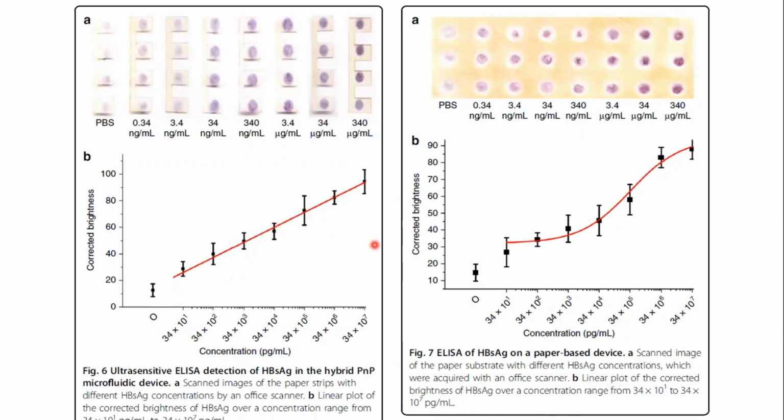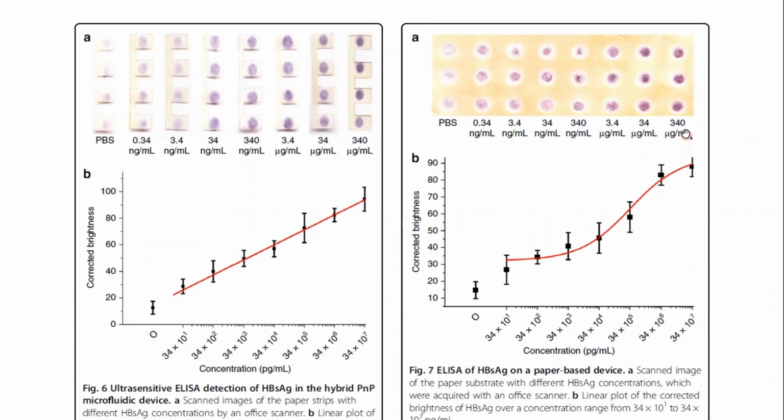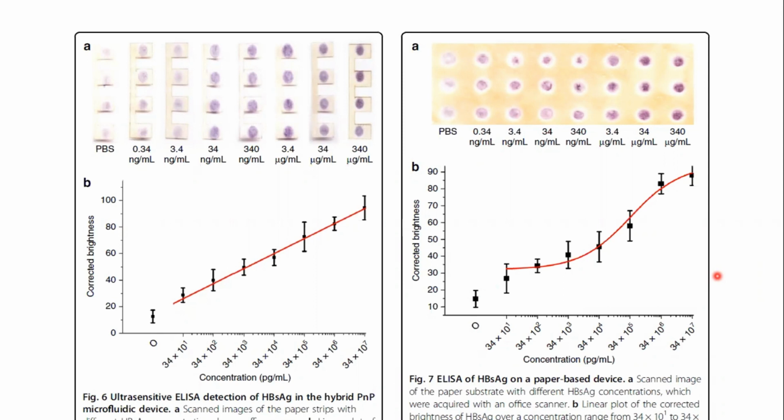of what I talked about before, the back and forth flow through the paper substrate using the chip. It allows us to have better immobilization of antigens or antibodies used for these assays. This is not happening when using only a paper-based device, because the sample or the reagents are placed just once, and after that there are no more steps. We are not having an optimal flow or optimal enrichment cycles for the paper substrate.